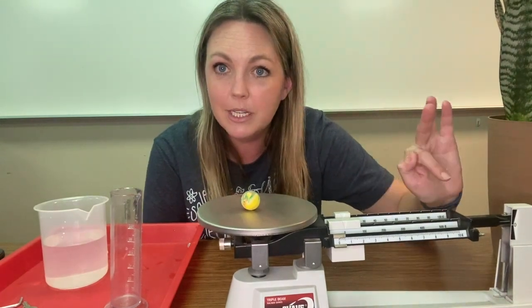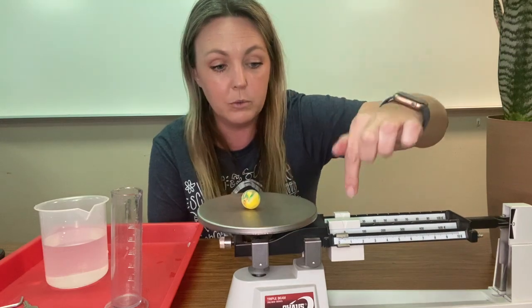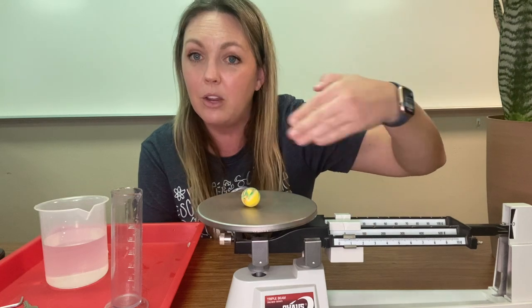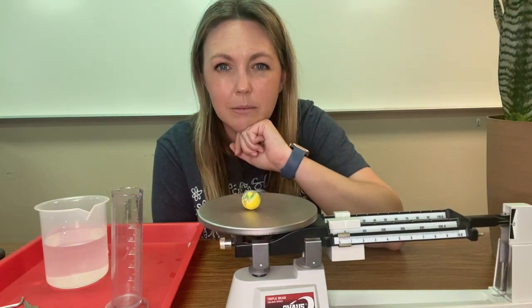Instead of continuing to go by 10s, I want to go by ones again — just like going from 9, 10, 11. We have 10 in the back and then each single digit number here would be like counting up by ones again. It is just over 10 grams.